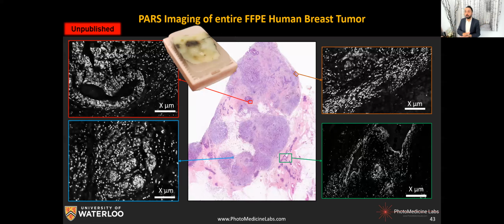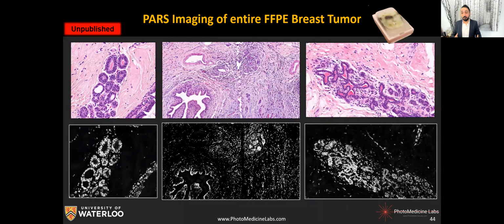So if we can directly image them, we hopefully can save a few days. And also this speaks of the quality of the system in terms of signal to noise ratio and resolution, because this is very difficult to image. So this probably gives a better idea.